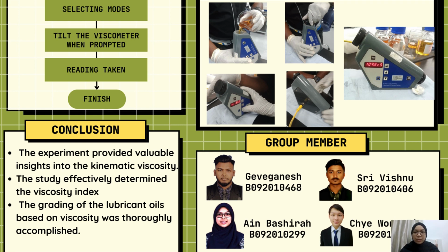For the conclusion, firstly, the experiment provided valuable insight into the procedure for measuring kinematic viscosity. A key aspect is assessing the flow characteristic of lubricant under the influence of gravity. This understanding is crucial for evaluating lubricant performance under various temperature conditions.